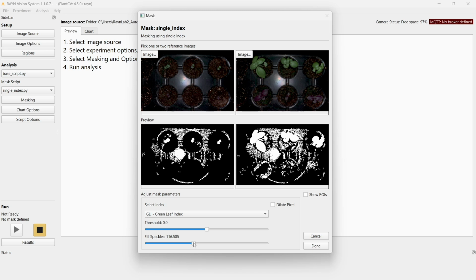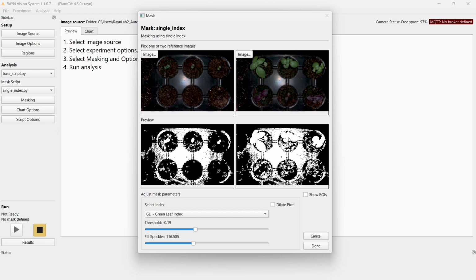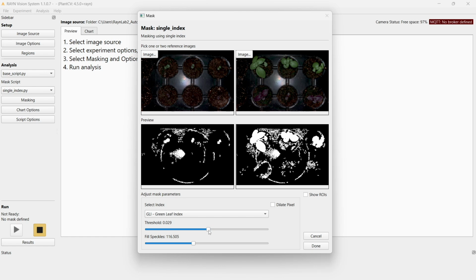Because then you can also sometimes fill this grain and salt noise, let's say. I'm not sure what the correct expression for this is, but you can try and get rid of this by that. Right.